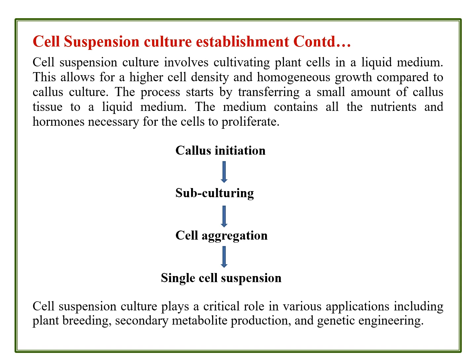So the process starts by transferring a small amount of callus, already cultured either from a previous liquid culture or callus culture, to liquid medium.